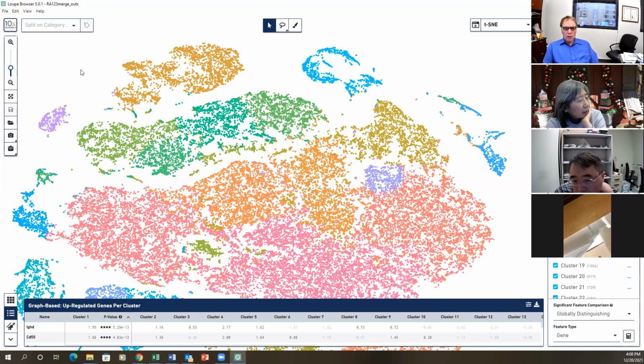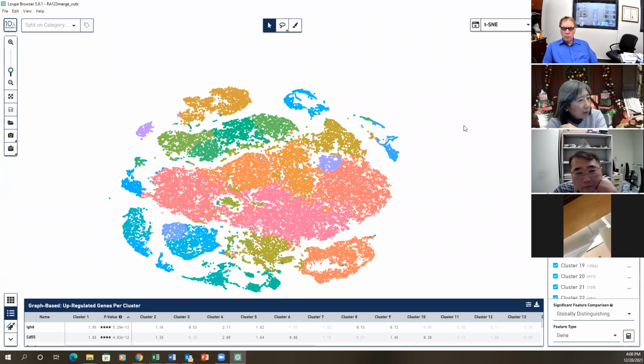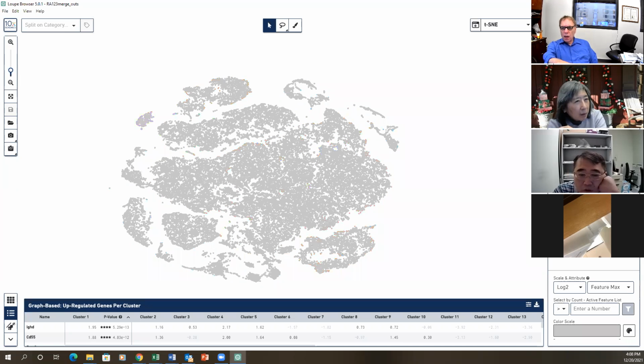So in this case, take a quick look at the total seq part. No, not the total, the CiteSeq part. Right. Let's say the first one. How many samples are there? Three groups, a total of 6 mice. So this is all 6.